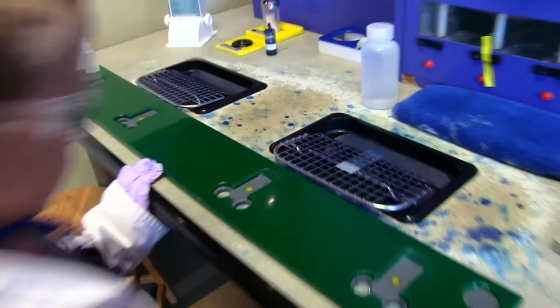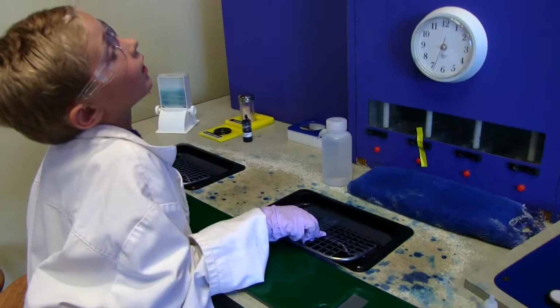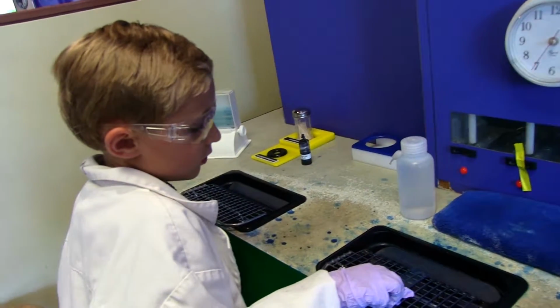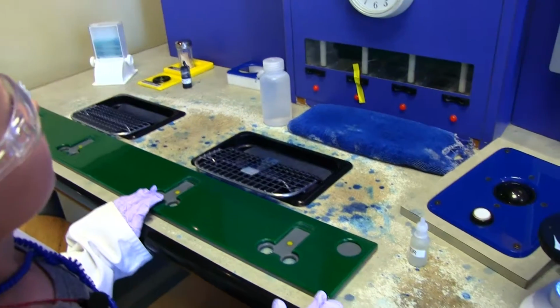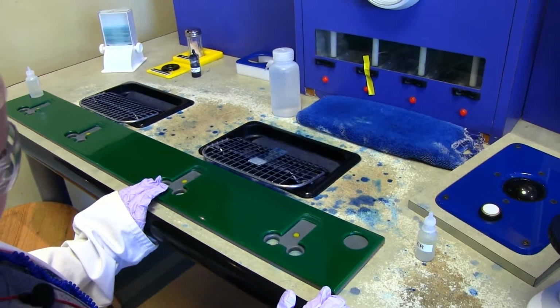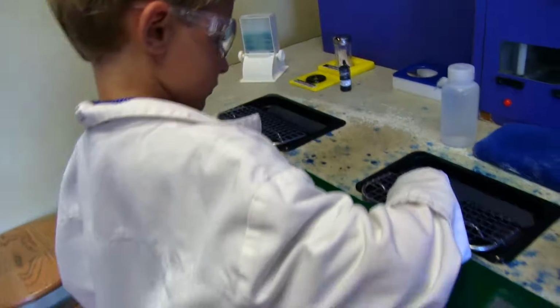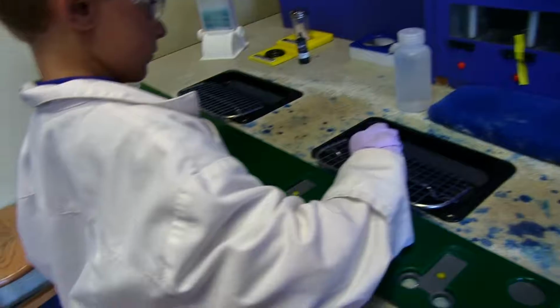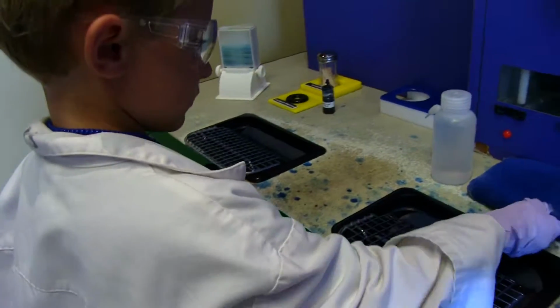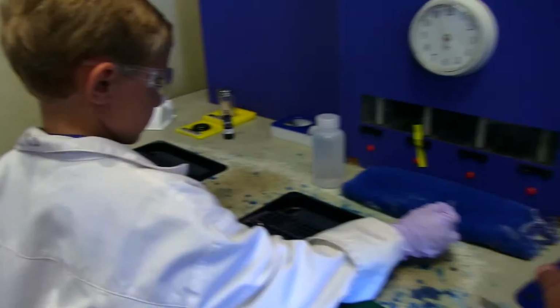There you go. Now what do I do? Let the blue water run off and drain. Gently blot the slide on both sides with the blotter, being careful not to remove the cell sample. Can you tap it on one side and then the other right there? Okay, there you go. Good job.